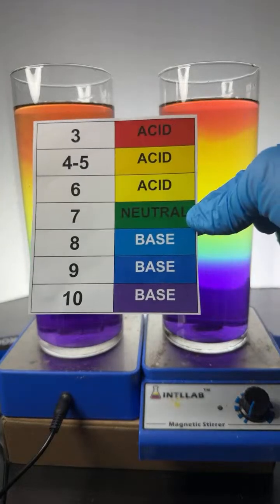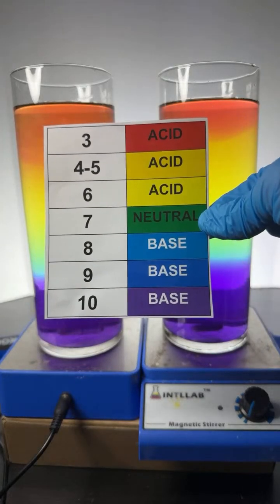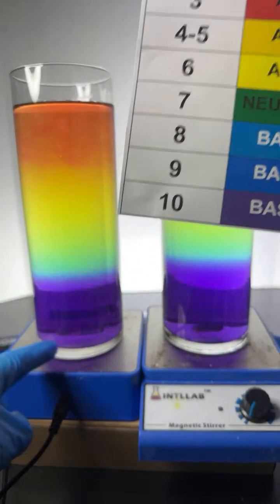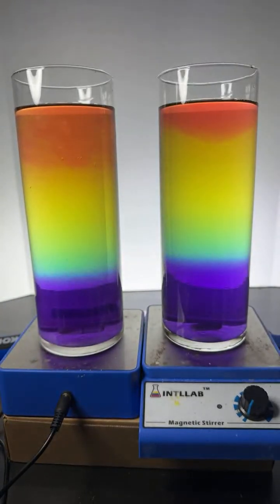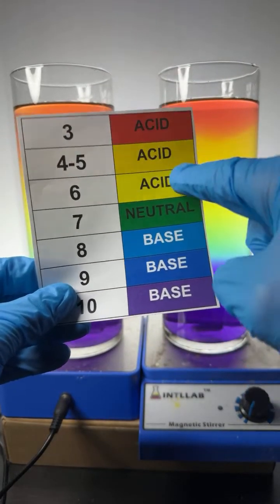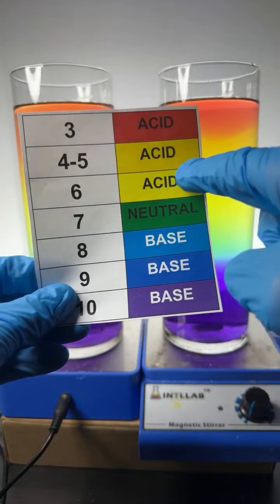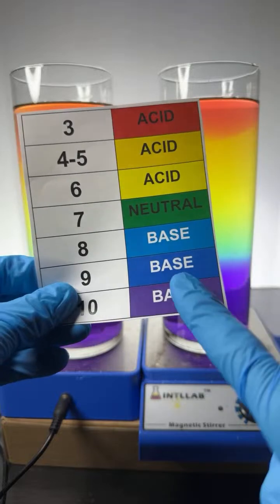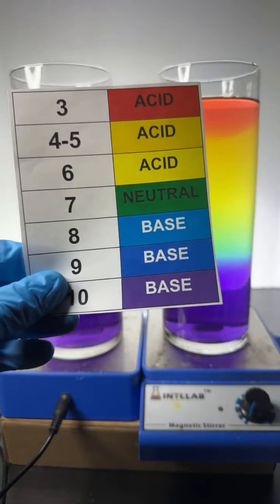Anyway, in these flasks, we have rainbow indicator. It displays different colors depending upon pH. If you look here, up at the top it's pH 3, and down here at the bottom it's pH 10. What's really fascinating is that the pH scale goes in powers of 10. A pH of 6 is 10 times more acidic than a pH of 7, so every step in the scale as you go this way is 10 times more acidic.